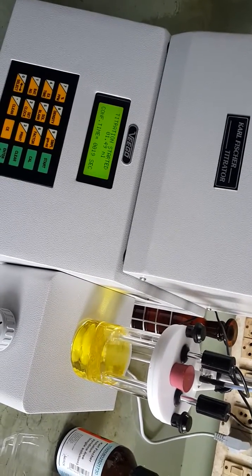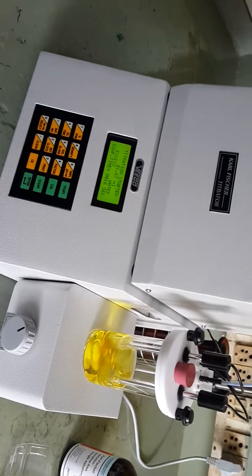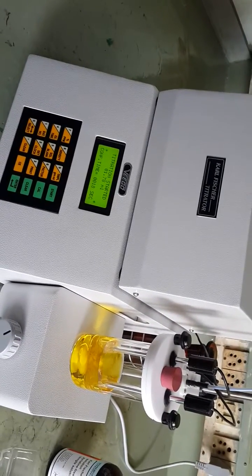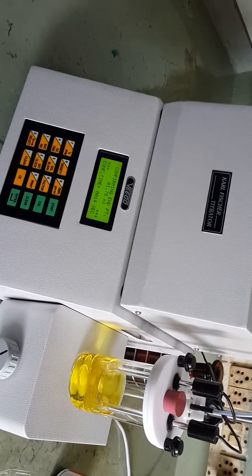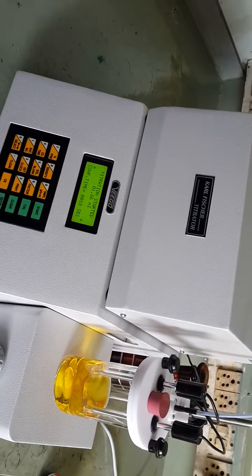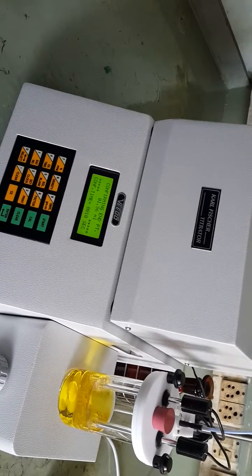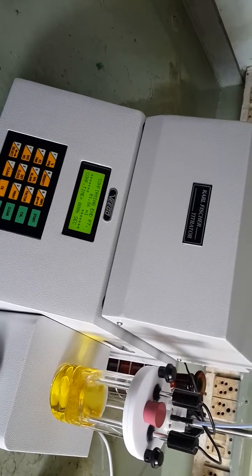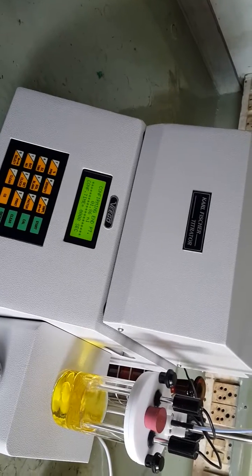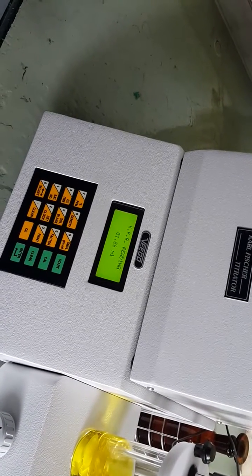Press the %/ppm key to find the result. We added a solid sample so we will enter the sample quantity in grams. The reading is 1.78 ml; it will wait until the confirmation time reaches zero for the final endpoint. During titration some water was found again — the excess water signal was on — so the reading has been corrected to 1.86 ml. The sample added was 0.1235 grams.